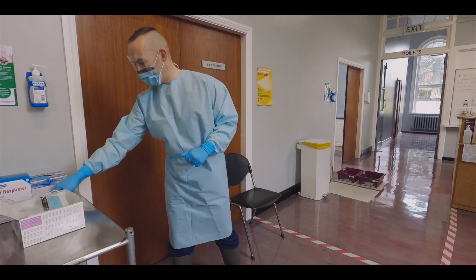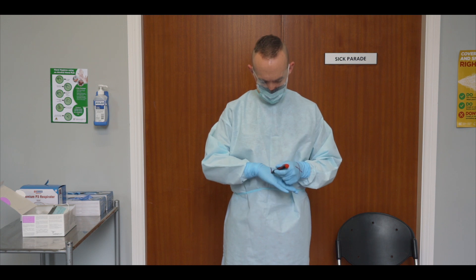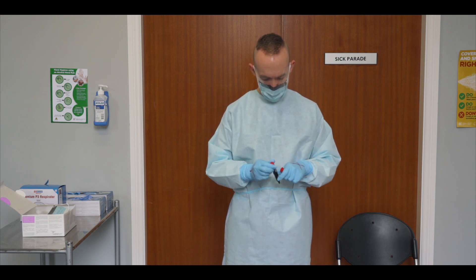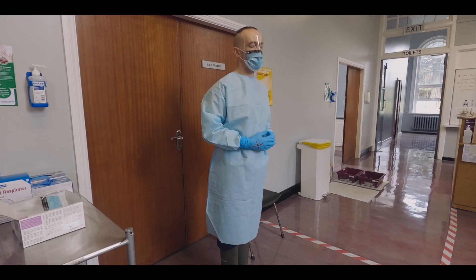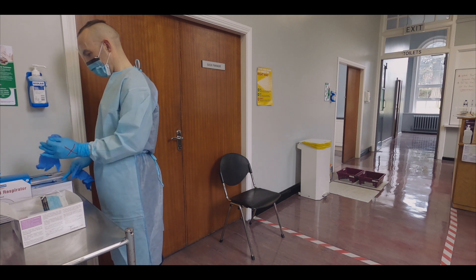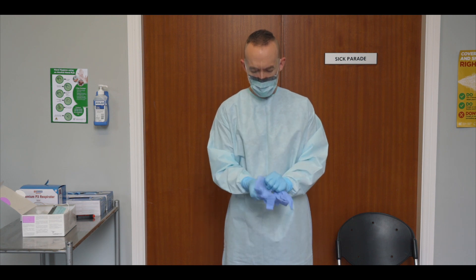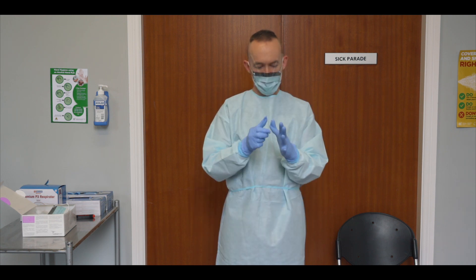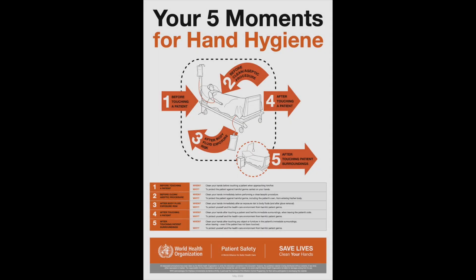Take the permanent marker and place an X on the back of each gloved hand. In situations where you may need to double glove, this will serve as a visual reminder that the gloves with an X are the last set of gloves you are wearing. In order to conserve PPE, you may wear a second outer pair of gloves which you can change between each patient contact in accordance with the WHO 5 moments for hand hygiene. This may occur in settings such as COVID-19 test centres or respiratory hubs.